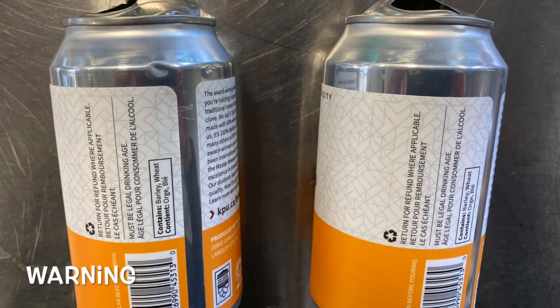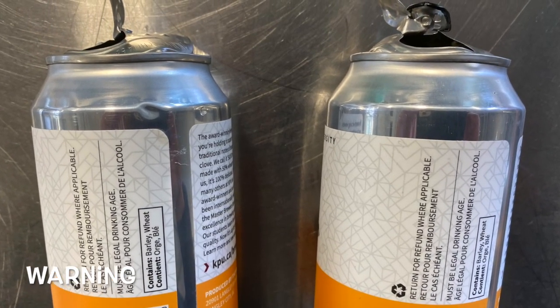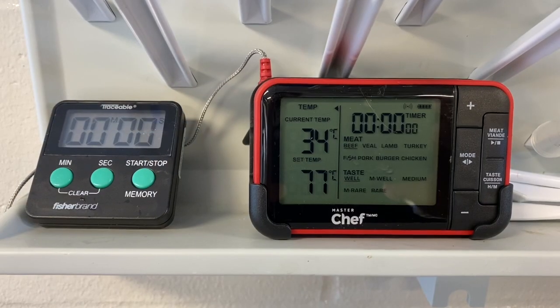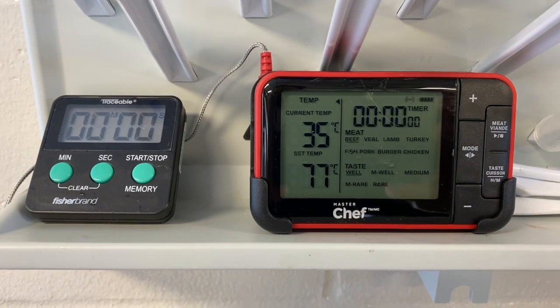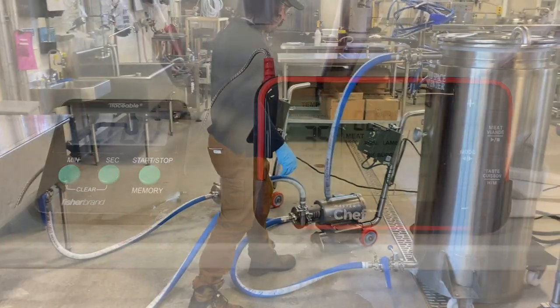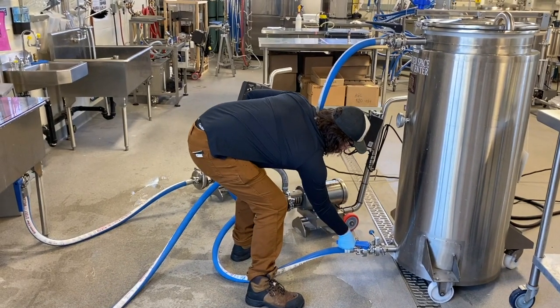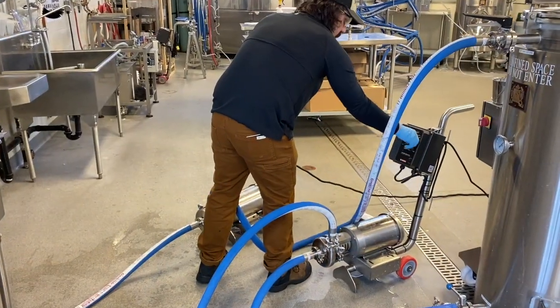Note that overfilled and overcarbonated cans can burst during the pasteurization process. Turn on the thermometer. After opening the valve at the bottom of the sink and the CIP tank valve, start the CIP pumps.